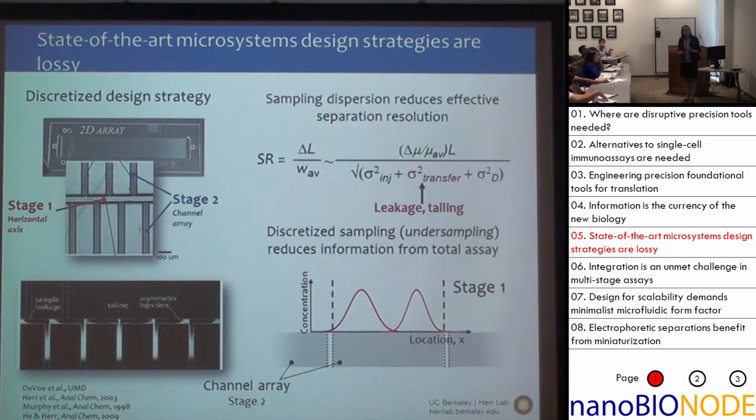And I'm just going to use this guy right here for today. Basically, the ability to measure multiple proteins in our system is locked in to the geometry of the device. Another way to say that is I can only do as many immunoassays as there are intersecting channels, right? So if I have one assay and I'm looking maybe against 3 targets, I want 3 immunoassays, maybe I only need 3 side channels. If I want to do another assay that requires 30, I'm going to need a completely different chip design, right? So I'm kind of locked into that chip. It's a little bit more complex than that, but basically, that's an issue.